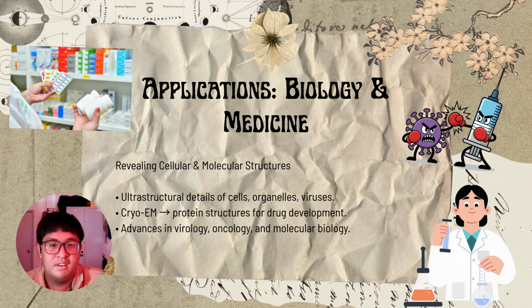In biology and medicine, microscopy reveals the ultrastructure of cells, organelles, and viruses. Techniques like cryo-EM allow scientists to visualize protein structures, a key step in drug development. This drives progress in virology, oncology, and molecular biology, helping us understand disease at the molecular level.